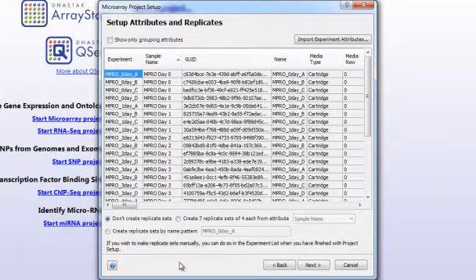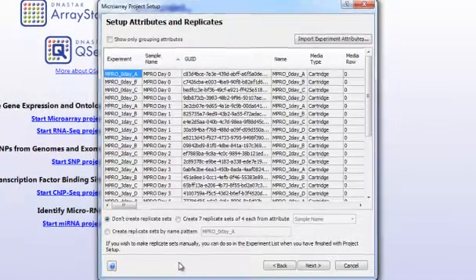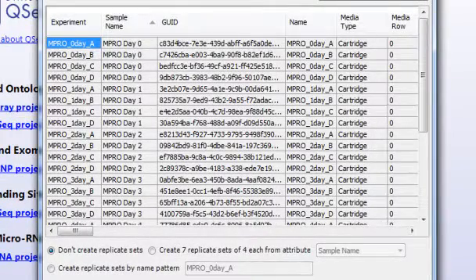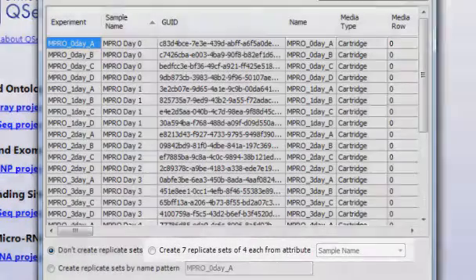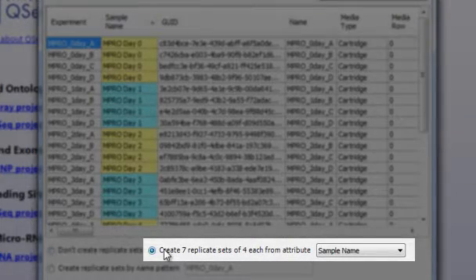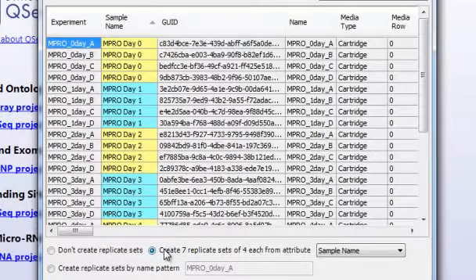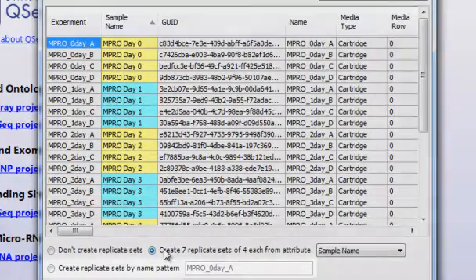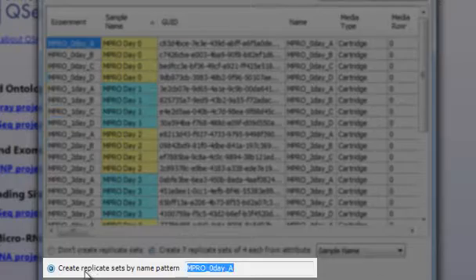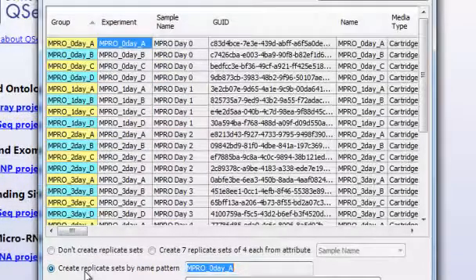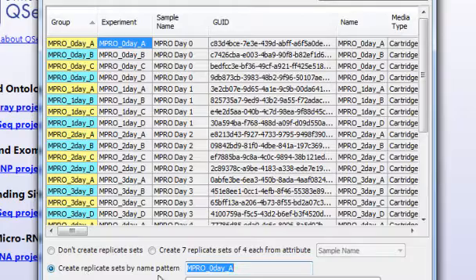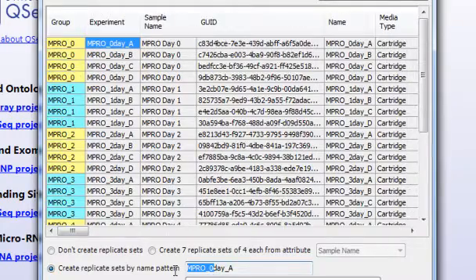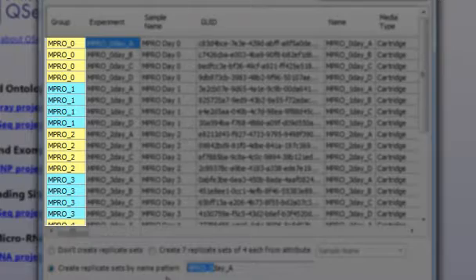You can create replicate sets in ArrayStar in a variety of different ways. One option is to select Create Replicate Sets from Attribute, where replicate sets are created based on the grouping shown for the selected attribute. You can also select Create Replicate Sets by Name Pattern, where the set is created based on a part of the chip name. Simply highlight the portion of the chip name that you wish to group by. All proposed replicate sets will be shown in alternating colors.